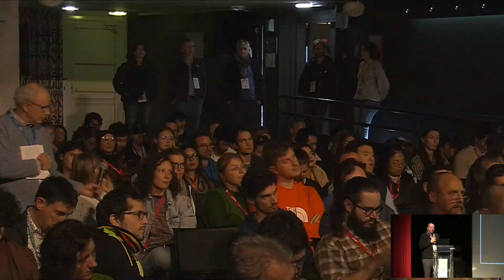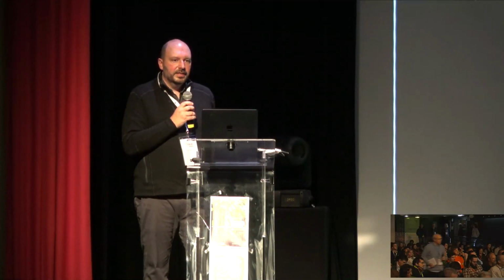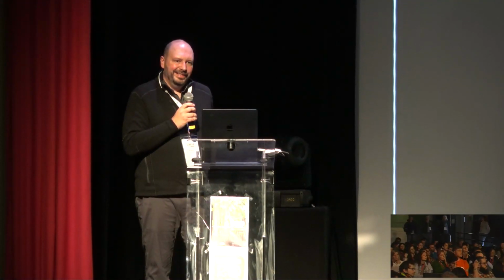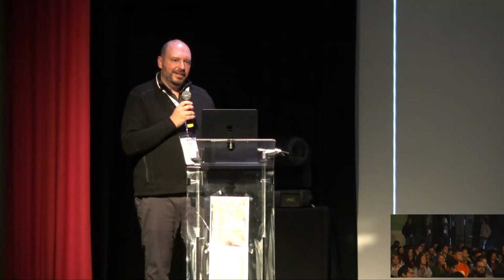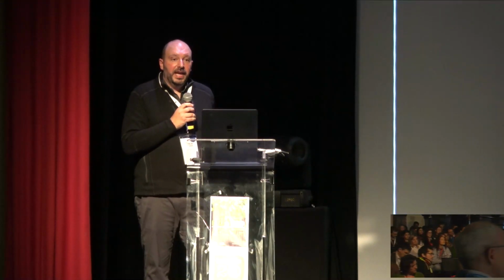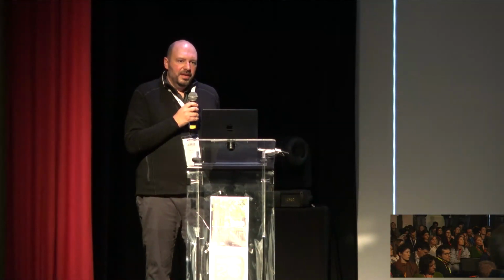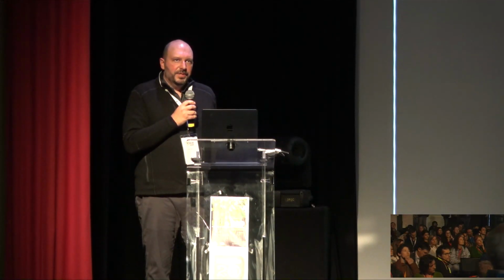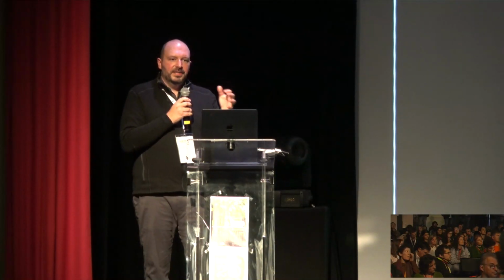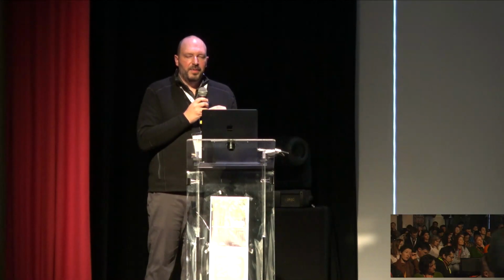Right. So to answer your first question, there have been a few users in plants. I think they've actually just put some stuff in Arabidopsis, like soaked it in the water. And in some cases, they were able to get good labeling with the halo tag. I'm happy to put you in touch with those folks. We don't have a lot of information, but there have been some successful attempts. So it's probably worth thinking about.